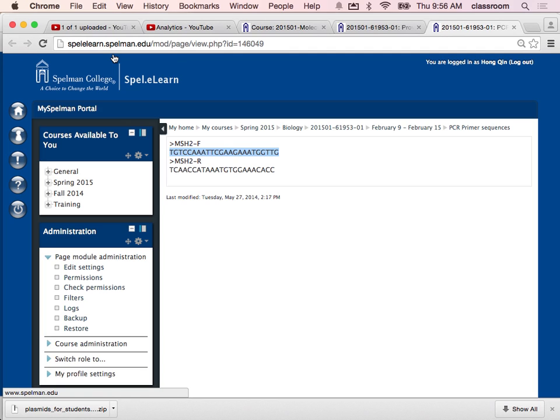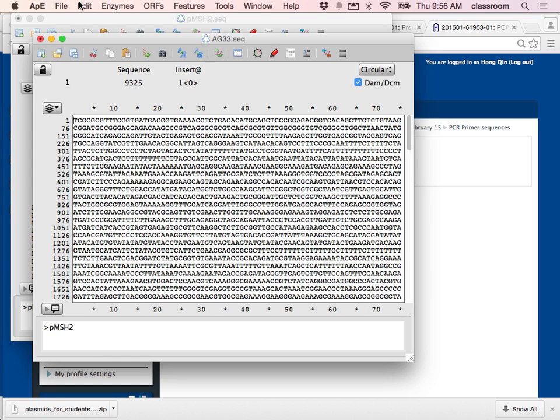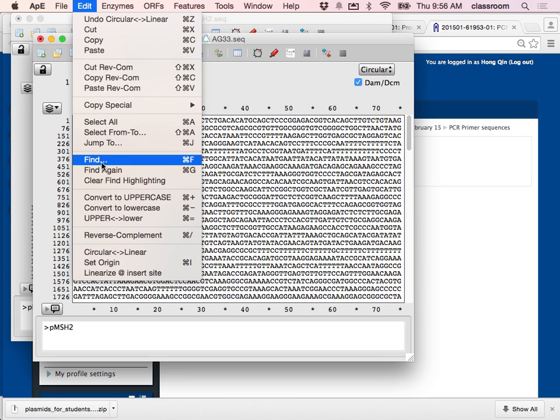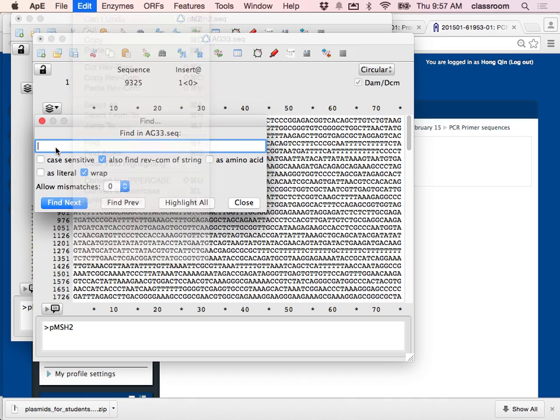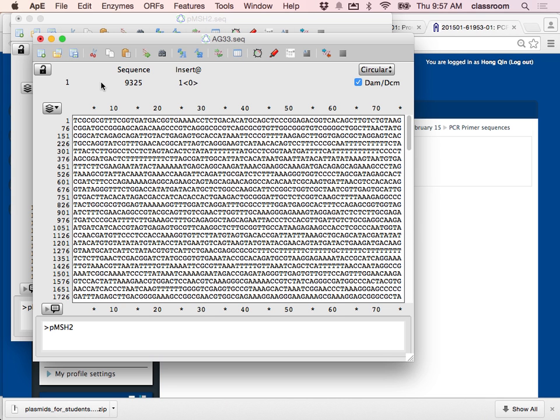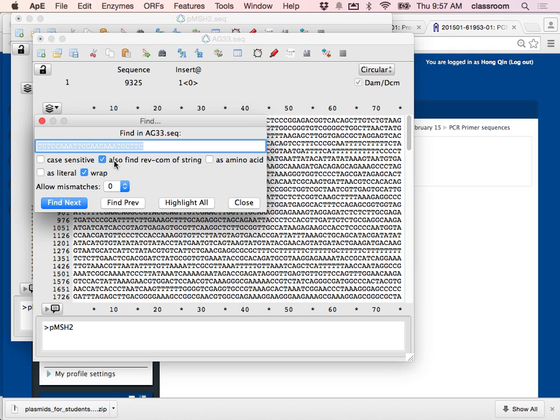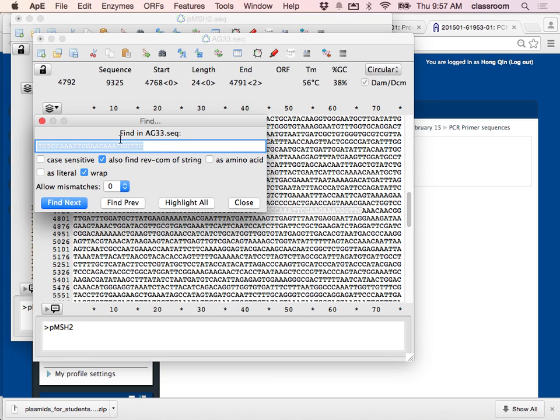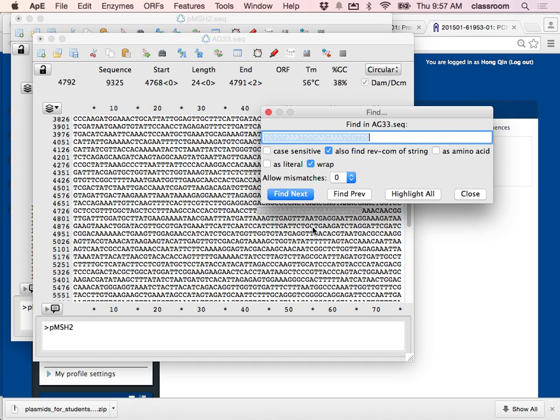I copy it from the web browser, go back to APE, go to Edit, then Find, and paste it. I verify TGTCCAA — double check, that's correct. By default it searches not only the sense direction but also the reverse complement direction. I click Find and it found the sequence. I check whether this is a sense direction or antisense direction — TGTCCAA at the bottom — it looks like this is the sense direction.